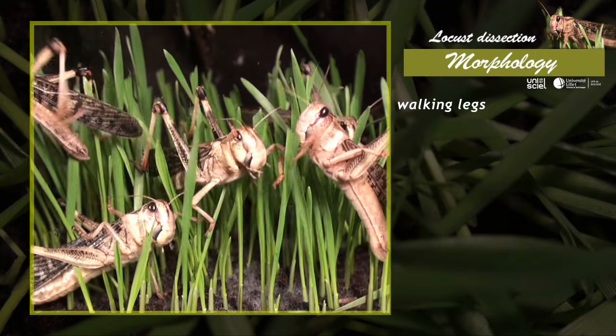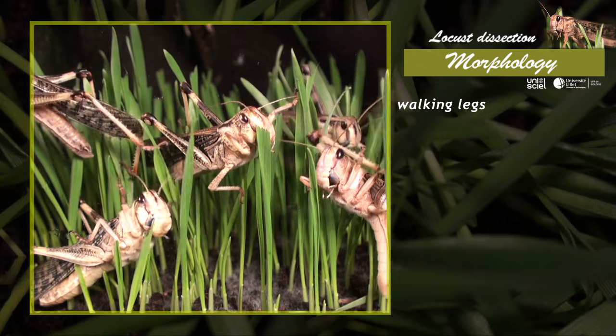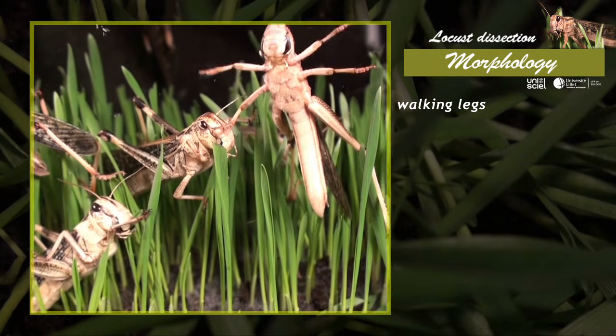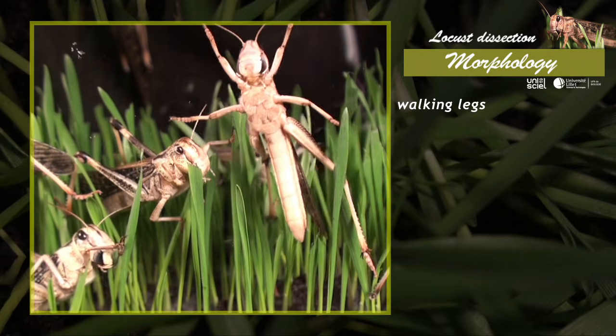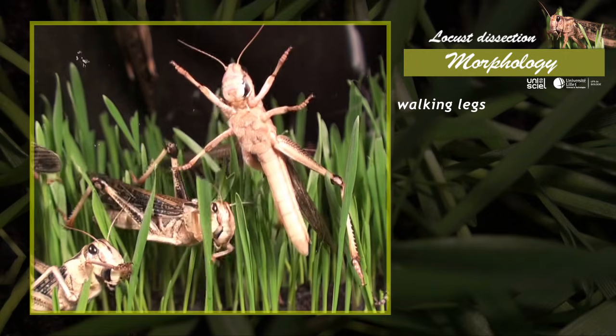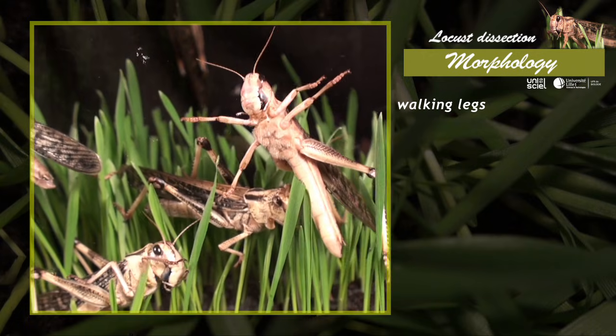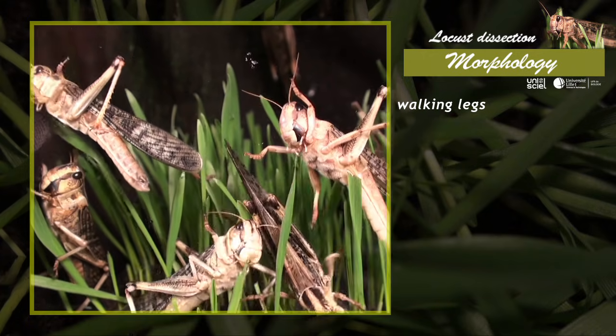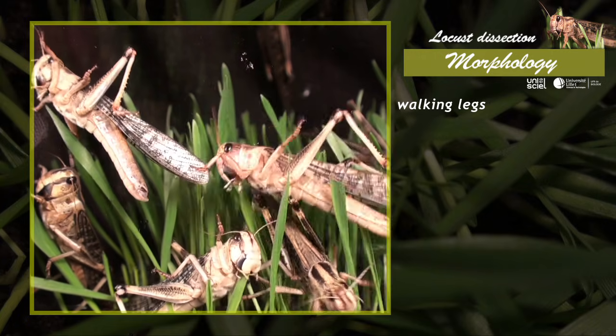Each segment of the thorax bears a pair of articulated appendices, or walking legs. The legs, built on the same organization plan, are of different sizes. The segments are clearly visible on the hind legs that are the most developed and permit the animal to jump.